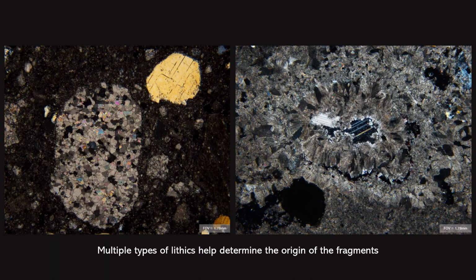So this is one of those carbonate fragments with the left side of the image in cross-polarized light and the right in plain polarized light with a total field of view of 4.45 millimeters. This is what a lot of the fragments that I observed looked like. That is very angular and made up of fine-grained carbonate minerals that stands out against that really dark purple fluorite matrix. There is a variety of different clasts throughout the sections, and the mineralogy of these can help to determine where they originated from and therefore what part of the breccia assemblage you're looking at.